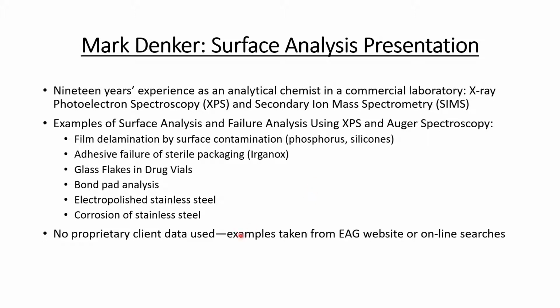My experience as an analytical chemist is in a commercial laboratory performing X-ray photoelectron spectroscopy and secondary ion mass spectrometry. In today's talk, I'm going to give examples of surface analysis and failure analysis using XPS and Auger spectroscopy.